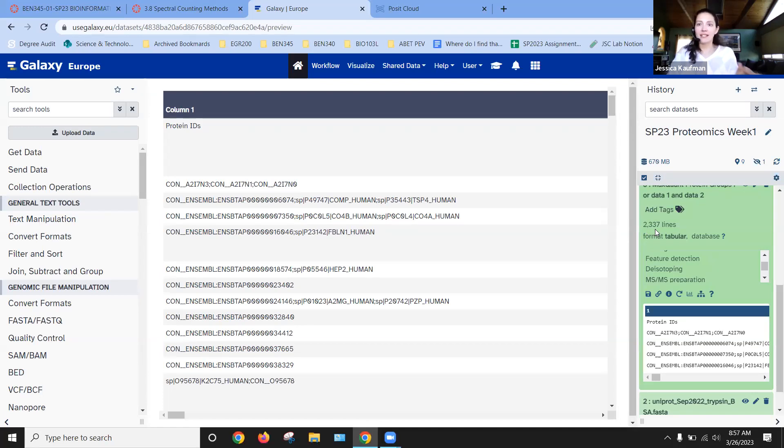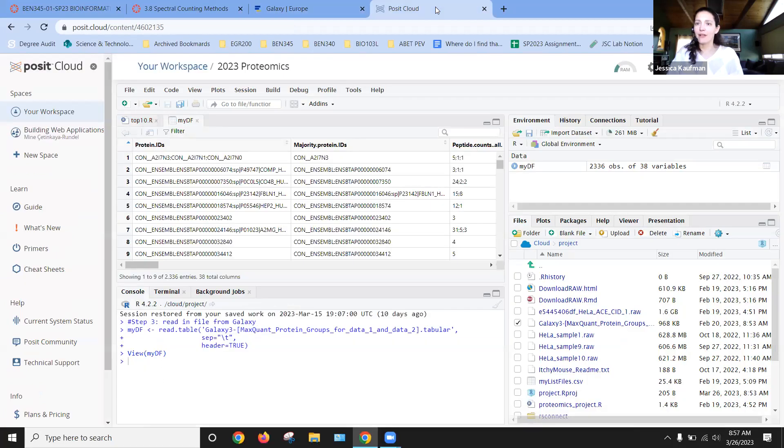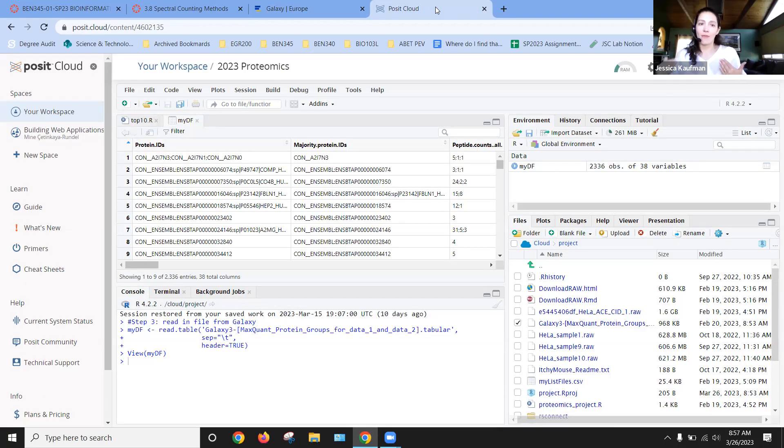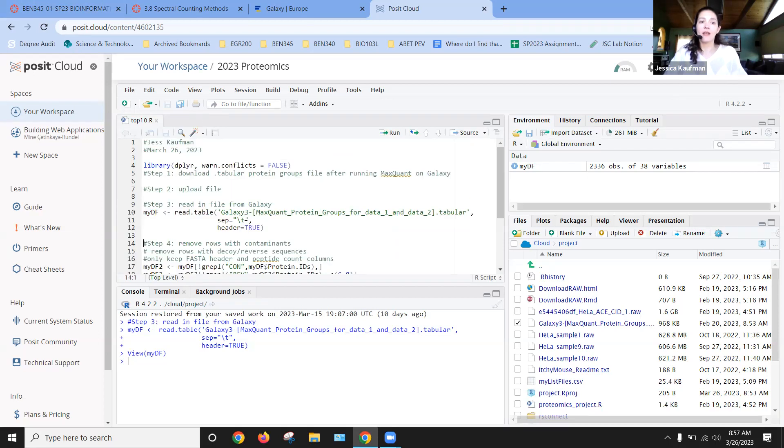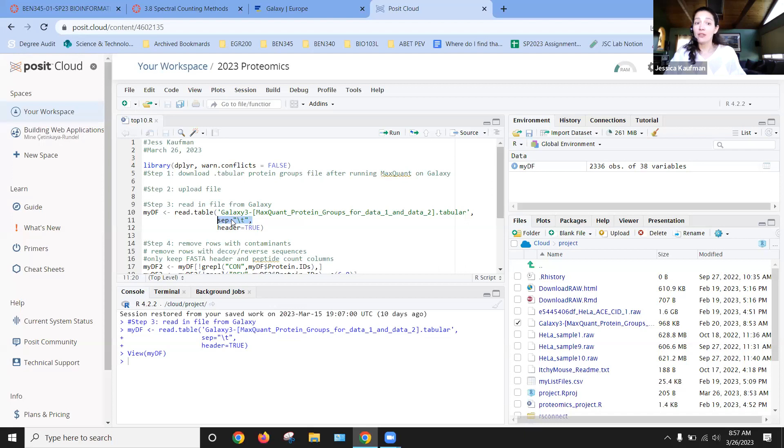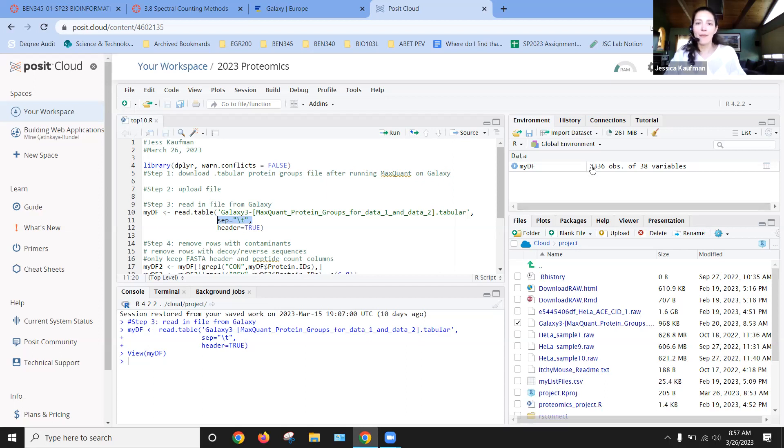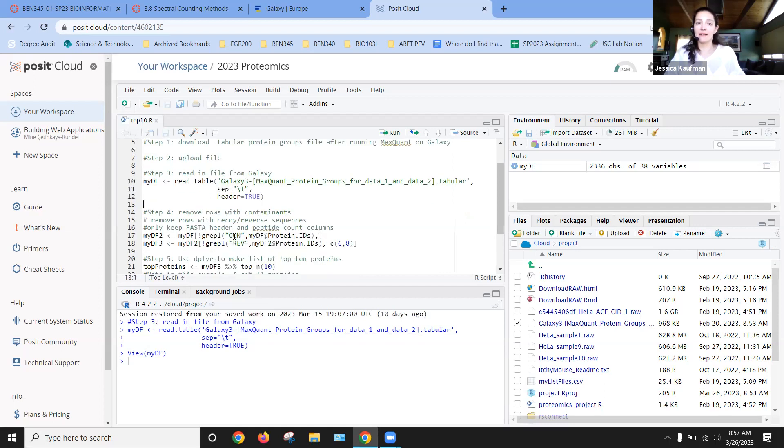So I know that I read in all of the data and nothing went wrong with that read.table command. One important thing with this file is it's tab delimited, so I did have to say the separator is a tab and that the header was true. So if those weren't there, that number won't match what you expect and you'll need to make sure that you're reading it in correctly.